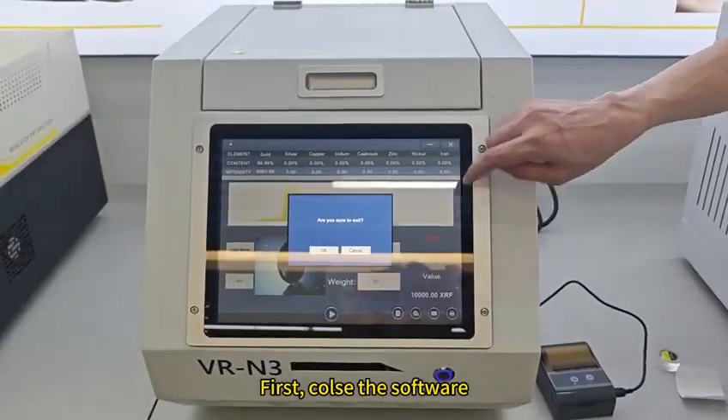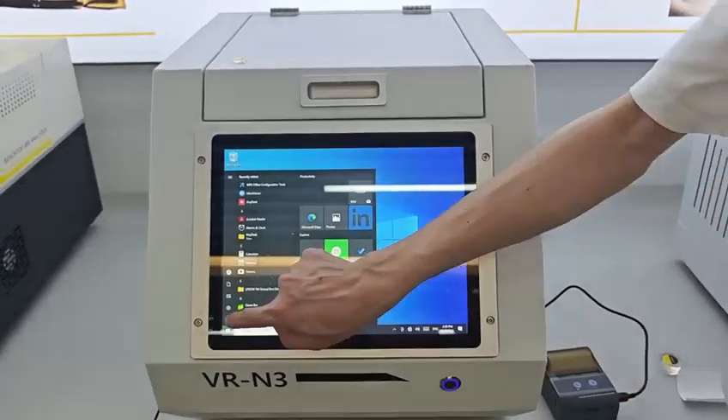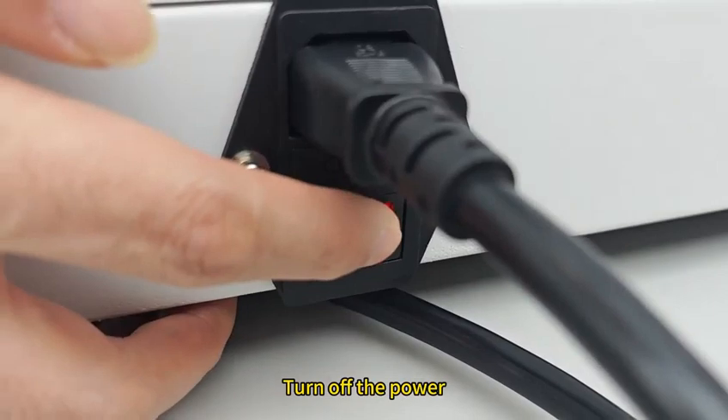First, close the software. Close the computer. After the computer is completely shut down, turn off the power.